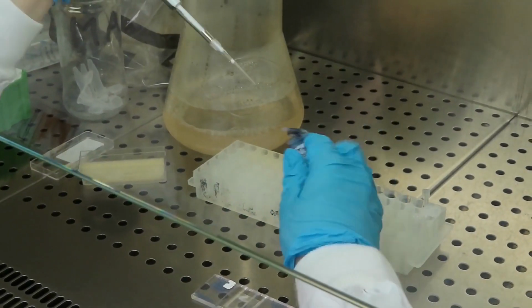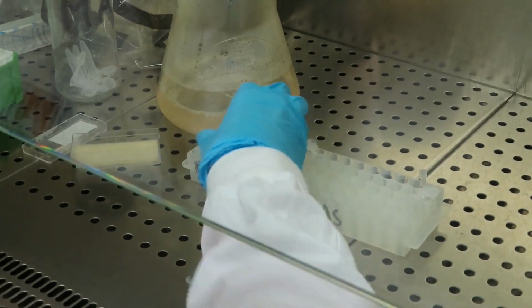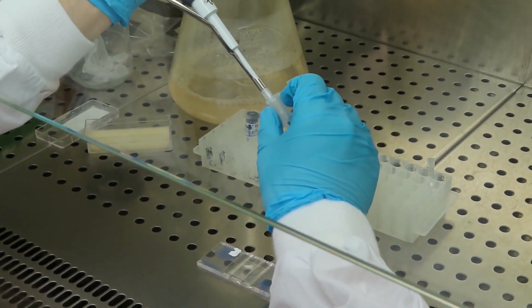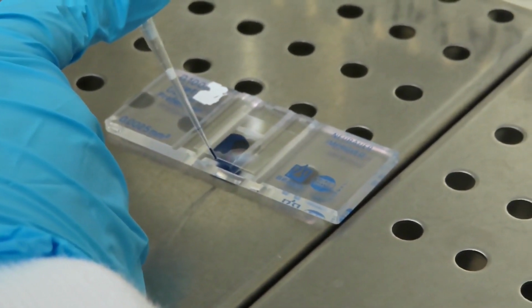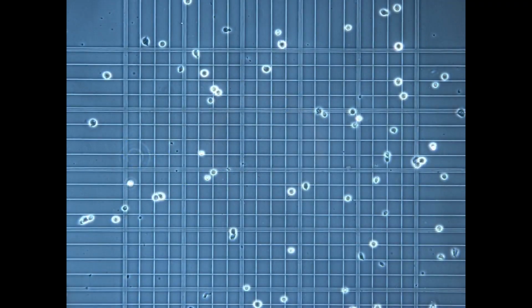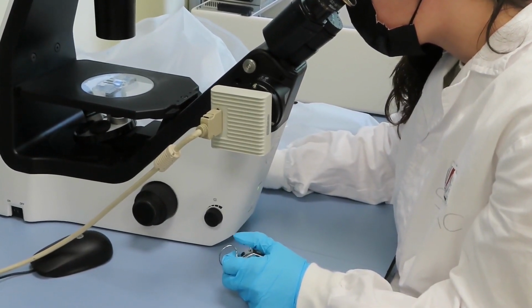To start with the transfection procedure, first it's necessary to look at the cells that are going to be transfected. An aliquot of the culture is taken and mixed with the vital dye trypan blue that stains dead cells. Cells mixed with the dye are introduced into a Neubauer chamber to determine their concentration and viability, and unstained cells with a birefringent round shape will indicate that cells are in good condition. The transfection normally requires a cell concentration between 0.8 and 1.2 million cells per milliliter.